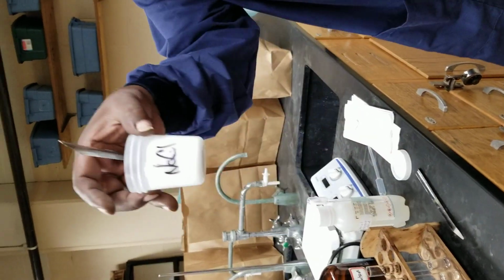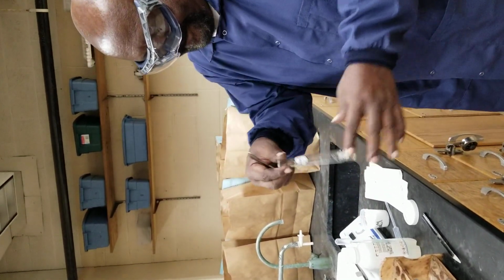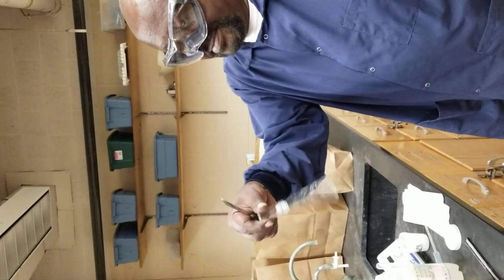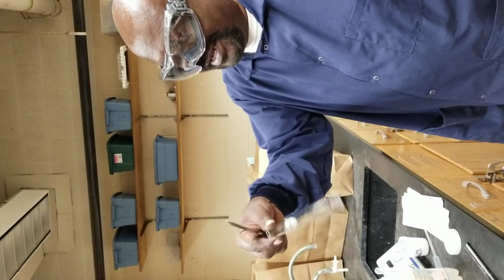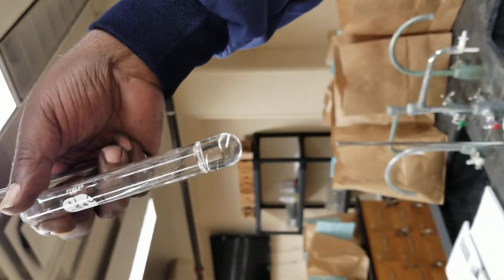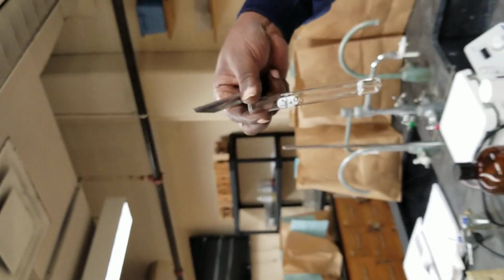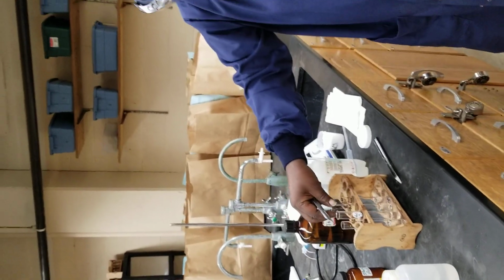Make sure I'm doing the right thing here. Of course, we know what the result is here. Complete solubility. We look underneath there. There's nothing sitting in the bottom. But we knew what would happen in this case anyway. Right, moving along.